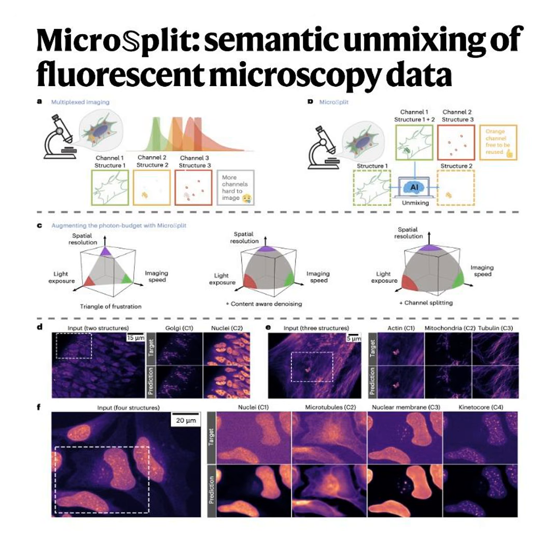It's brilliantly elegant. Okay, recap time. Bullet 1: MicroSplit calculates spatial prediction errors based on the variance in its posterior sampling. It gives you a literal heat map of its doubt. Bullet 2: its accuracy rivals the agreement rate between top human experts. And Bullet 3: it doubles as a tool for unmixing and removing structural image artifacts.